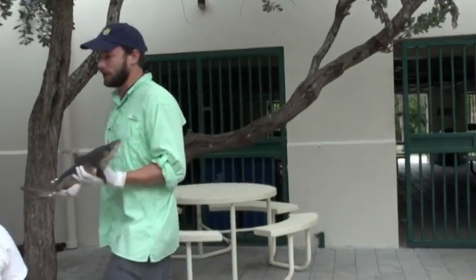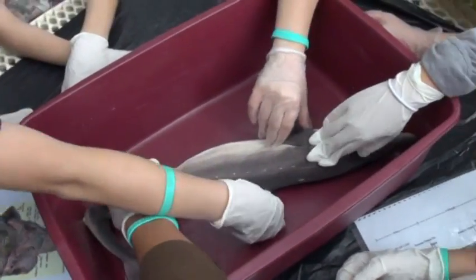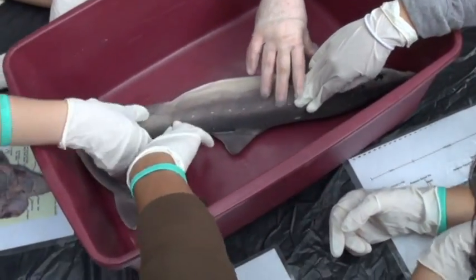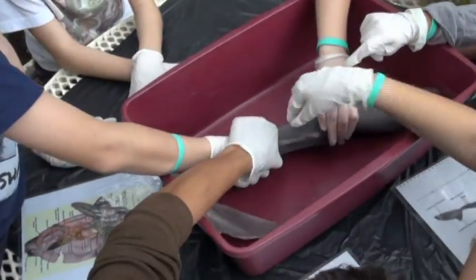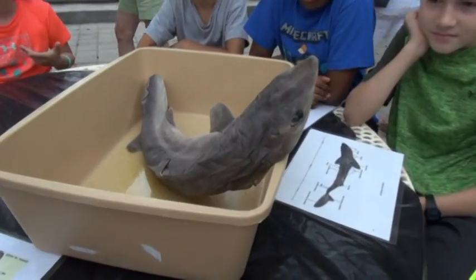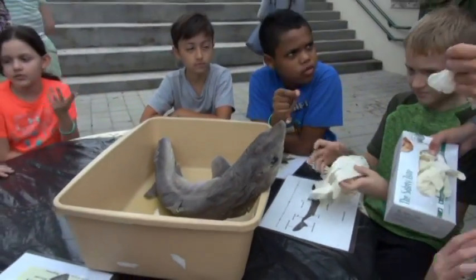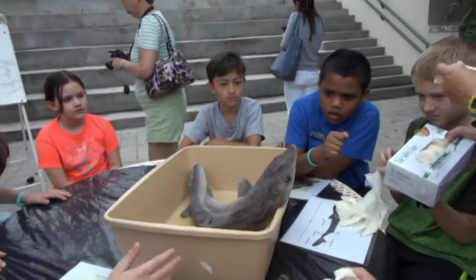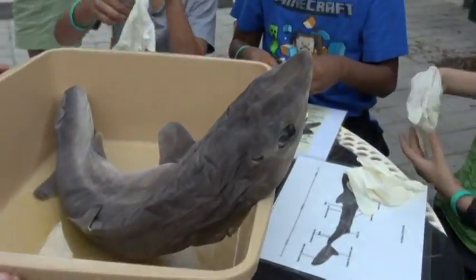But check it out, guys. Get your hands in there. Keep your mouth off of the shark, but check out all those fins. I'm gonna get that board turned around. The tail's been cut. Oh, what's in his mouth? That's what we're gonna talk about. That's where his teeth are. His teeth are really, like that jaw, that muscle that they have is really, really strong.